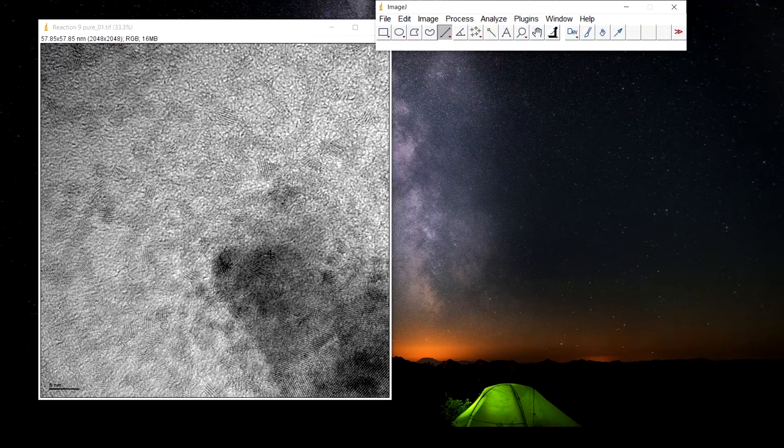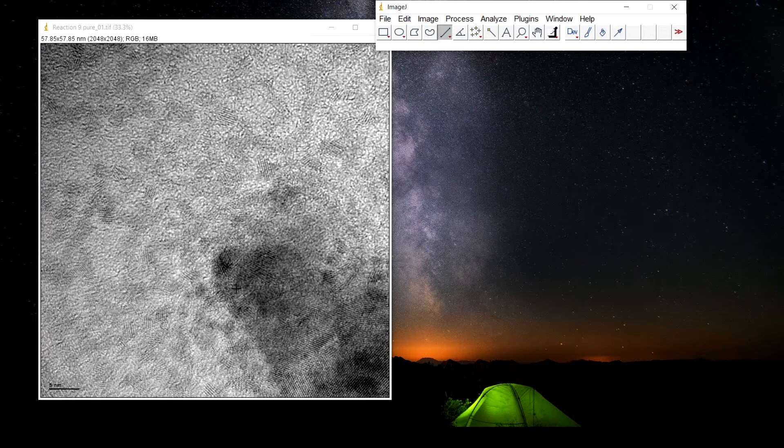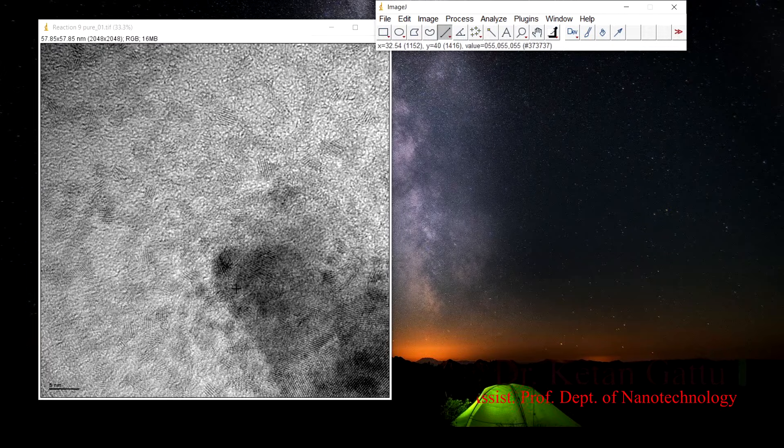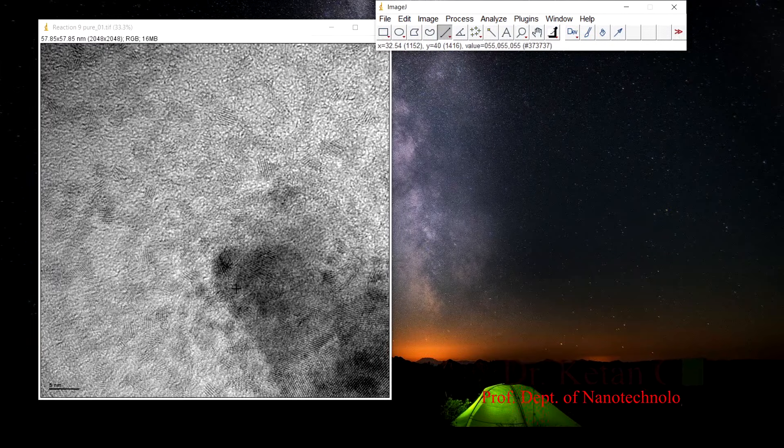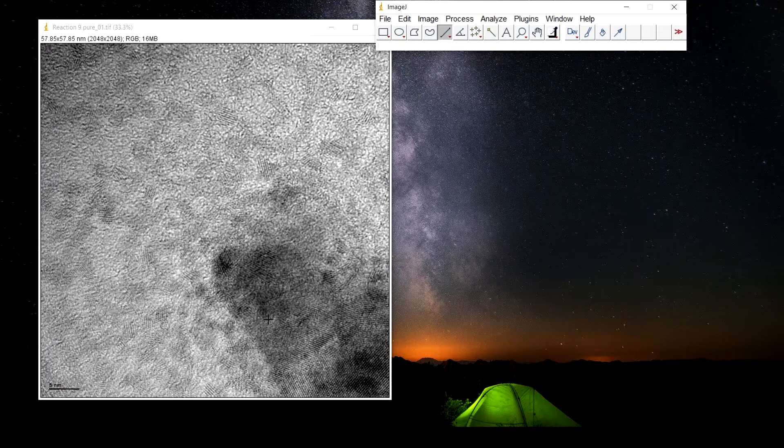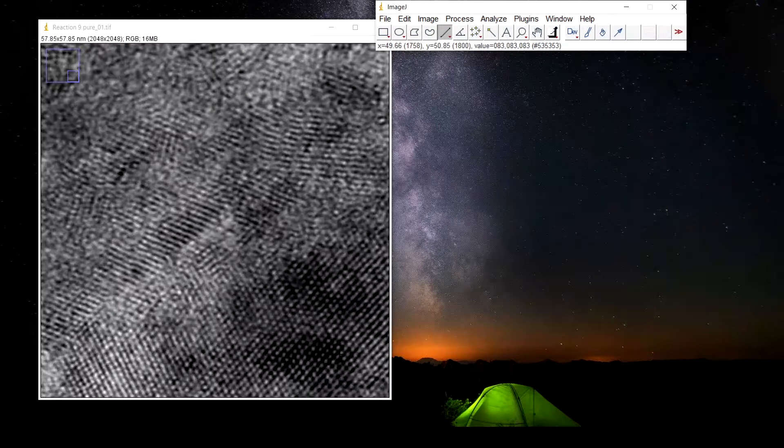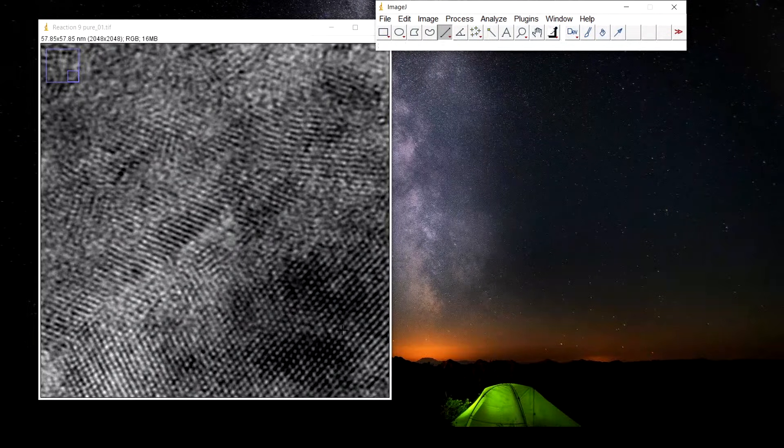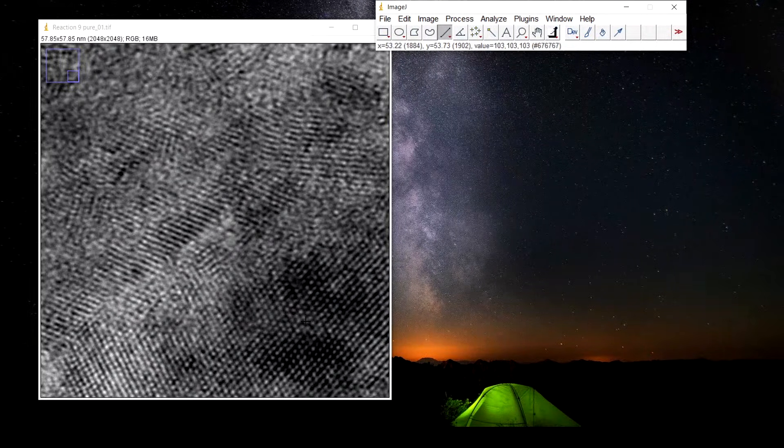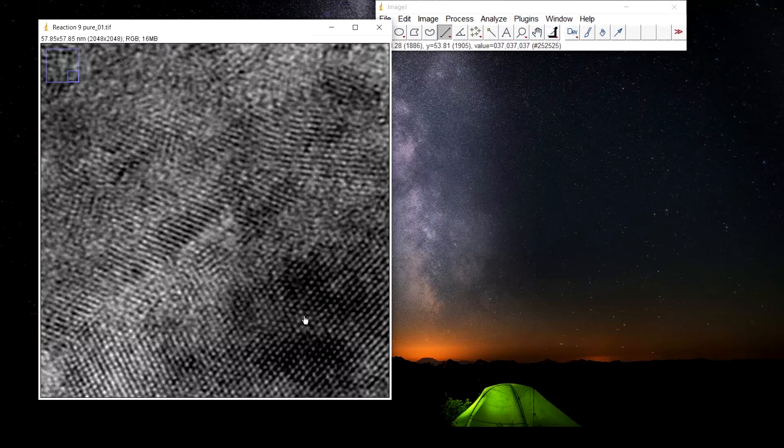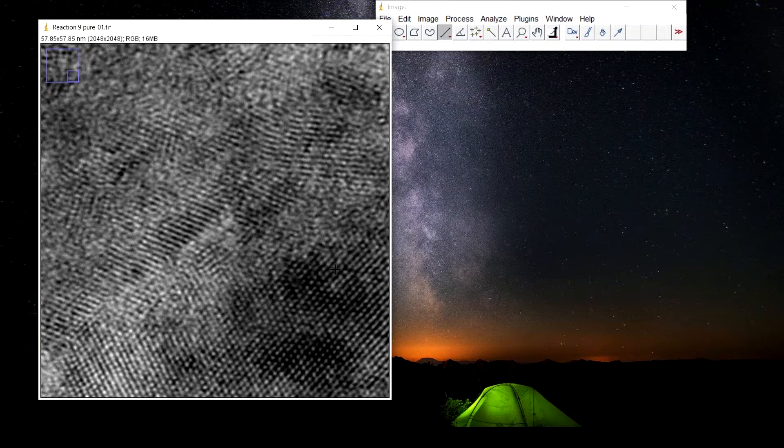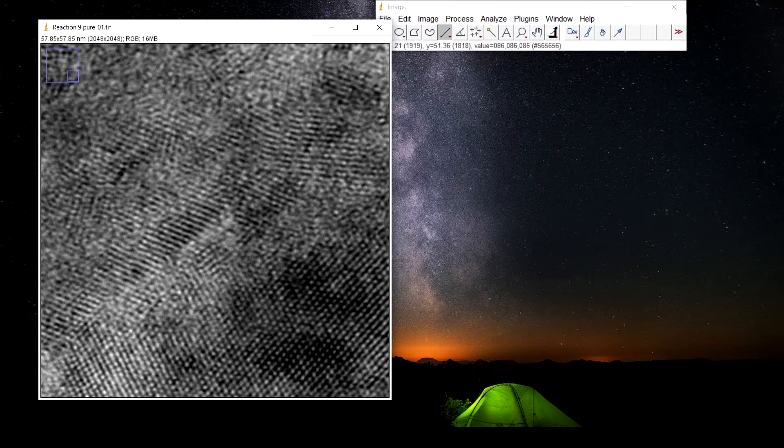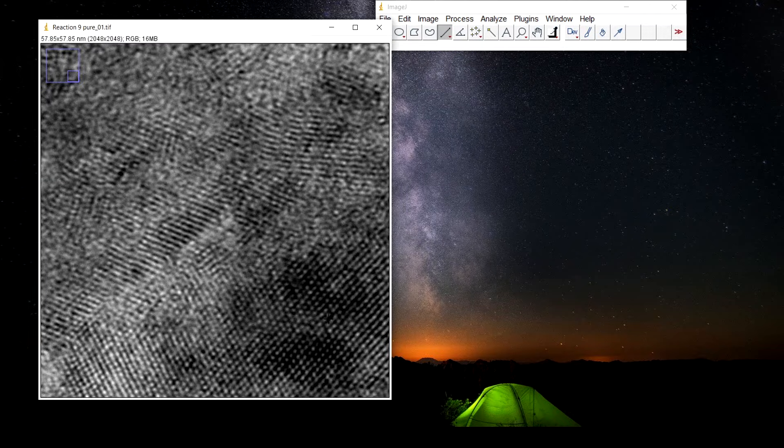Here we can see a transmission electron microscope image, high resolution transmission electron microscope image. When we zoom into it we can see the atomic arrangements of the material and we have to calculate the interplanar spacing between the two planes that we can see here.